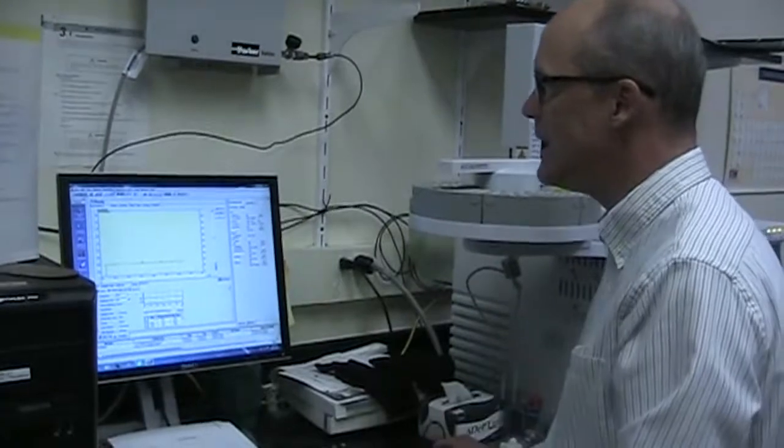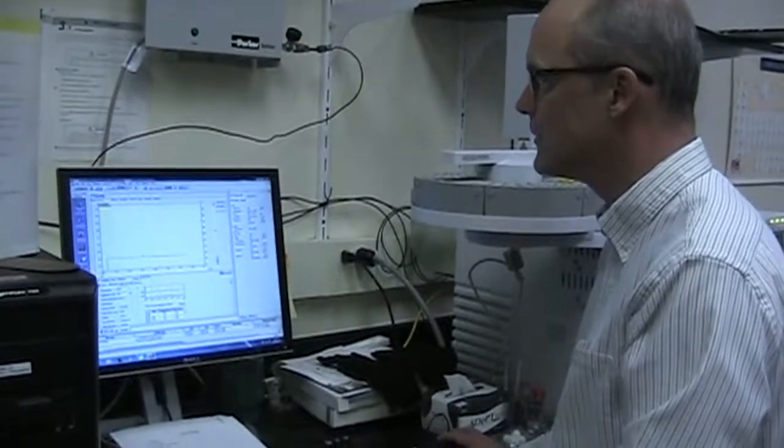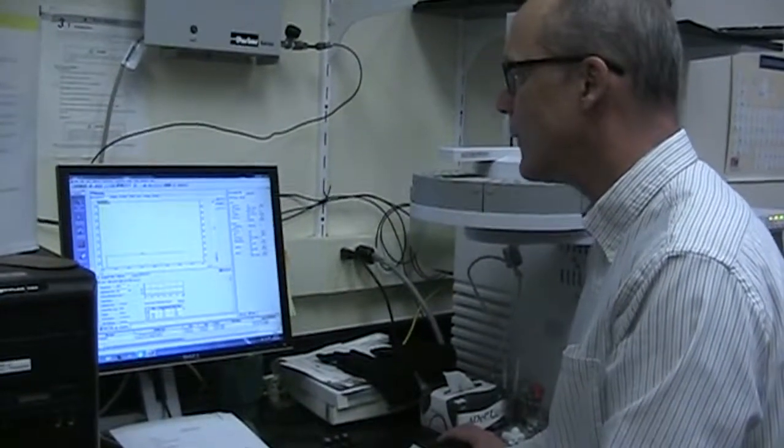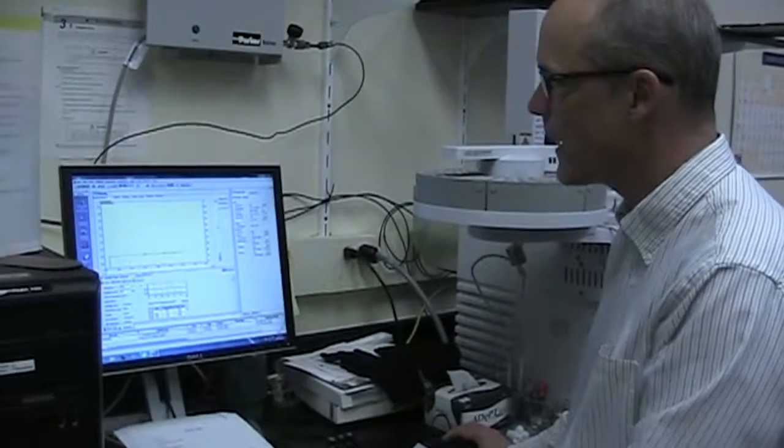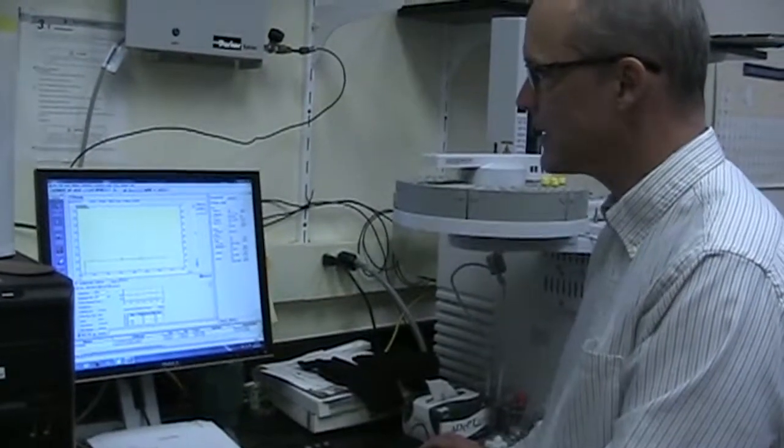From the main screen here, the instrument acquisition screen, if we click on single run, the single run icon, that'll get us to the place where we can log in the sample.